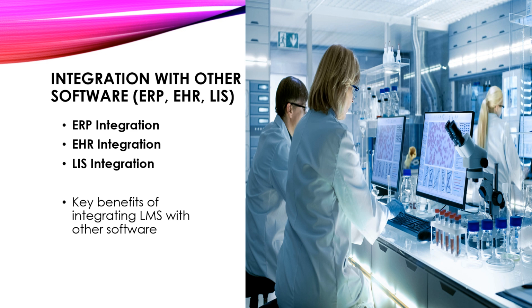LIS integration. LIS manages laboratory workflows, including sample processing, test scheduling, result reporting, and quality control. And integrating LMS with LIS streamlines laboratory operations by synchronizing data and workflows between the two systems. For example, when a test is ordered in the EHR system, it can automatically trigger the creation of a corresponding test request in the LIS. And once the test is completed, the results can be automatically transmitted back to the EHR for inclusion in the patient's record.